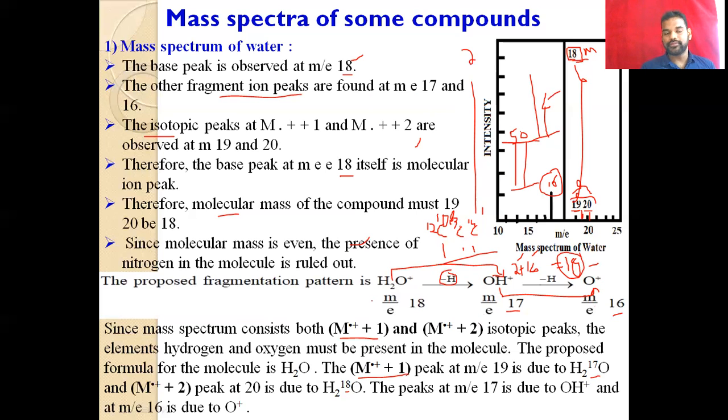But we know the spectrum we are dealing with is water, while normally in the research field we don't know which compound we have. We know only the molecular mass, then the ionic peak, isotopic peak, and then the fragmentation peak. And then we have to guess on the basis of these steps to identify which compound we have.